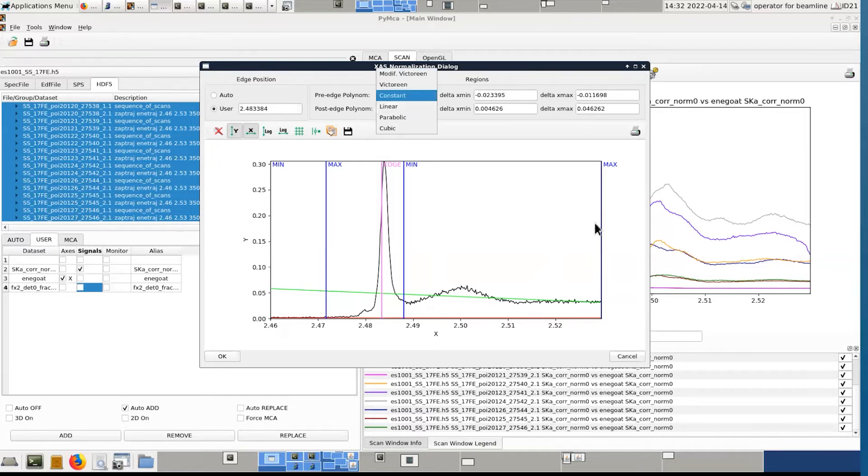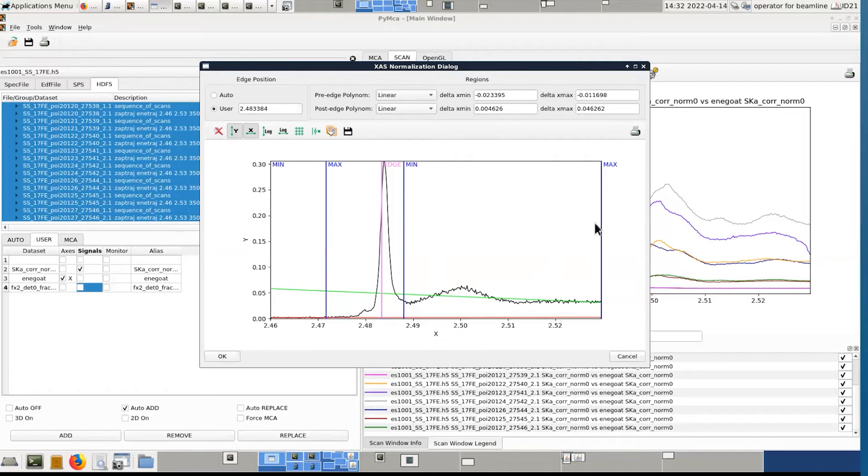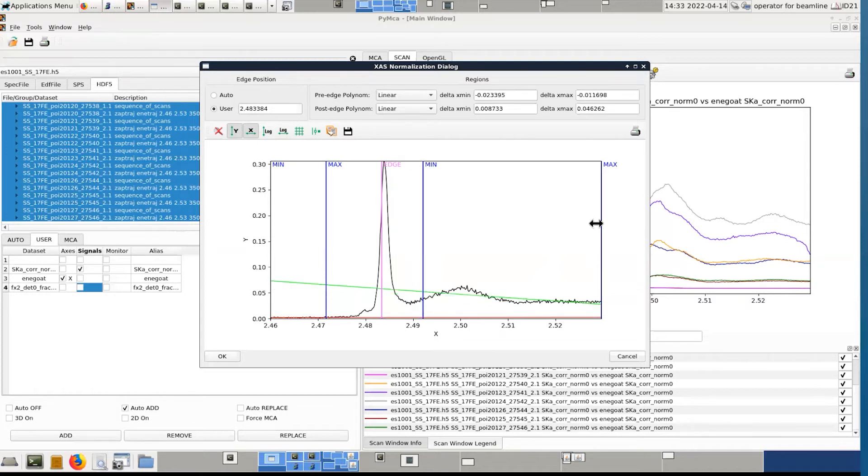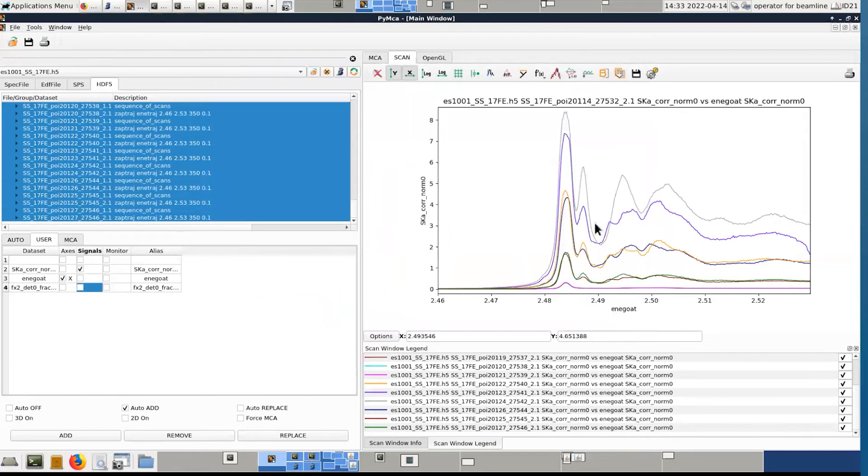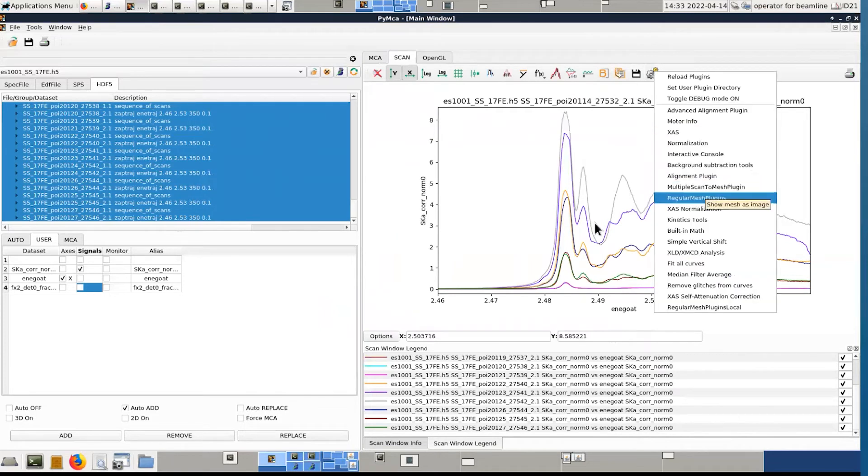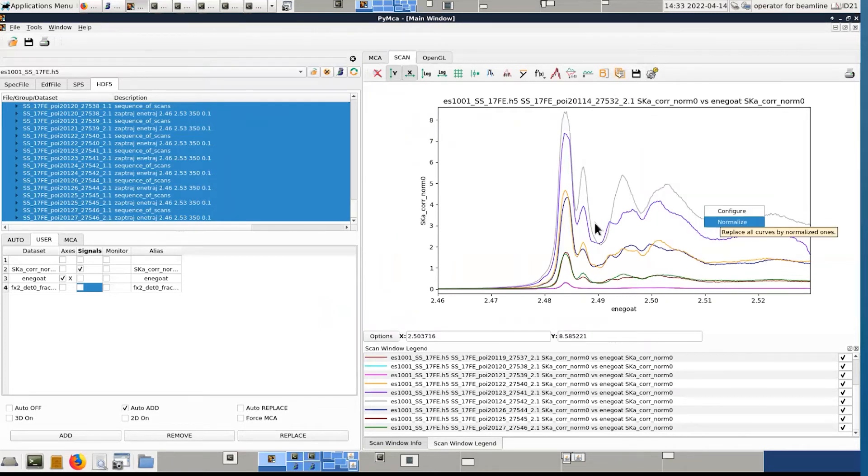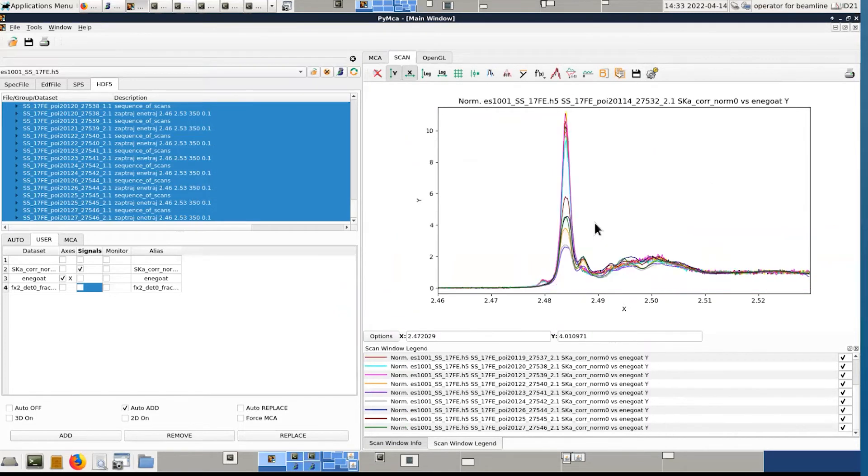If you want the edge position to be automatically or mathematically determined or if this is something you fix manually. And then the pre-edge polynomial function and the post-edge polynomial function. So for example, we could try with linear and linear. And then I can adjust. So here the pre-edge will be calculated in this region and the post-edge. And we can do something like this in this region. And once the configuration is defined, you can launch it and it will be applied to all the spectra.